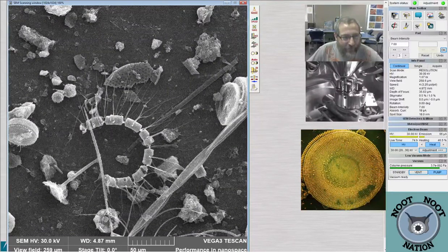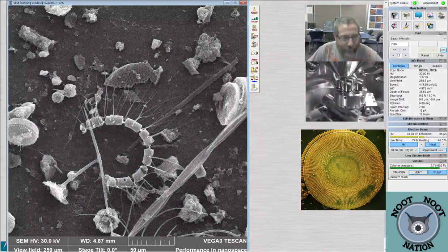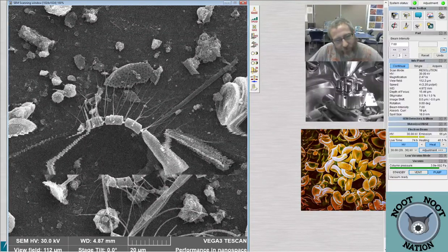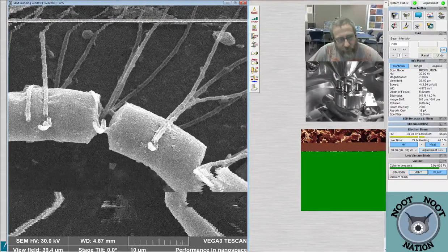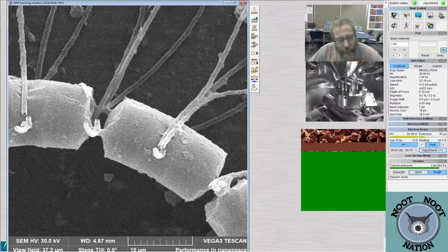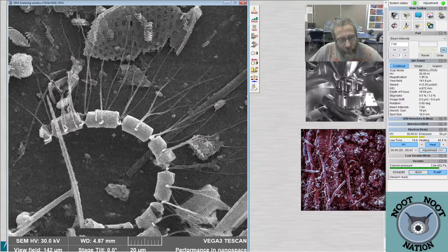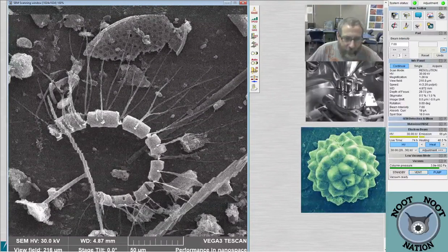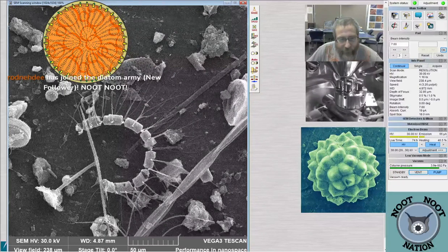And in here we have the sort of curled one, which is a Chaetoceros. It looks like all of the spines are pointed outward, which is kind of interesting. Then there are two that curl like that, and there's one that makes these long, curling, almost slinky shapes. Maybe it's debilis, otherwise it's curvisetus. Yeah, so cool. And then there's a Pseudo-nitzschia chain right here.